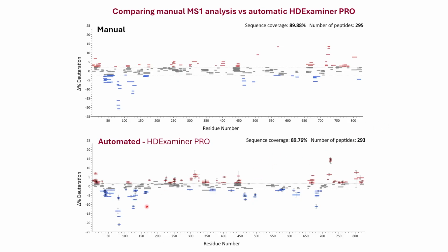The error bars on this plot represent the fragment populations coming from MS2 space. When we model the deuteration coming from all of the different subset of fragments, we can generate normal distributions. And with the normal distributions, we can plot their variances on the Woods plot directly to show you how much agreement there is between the final measurement and all of the different fragment populations in the data.